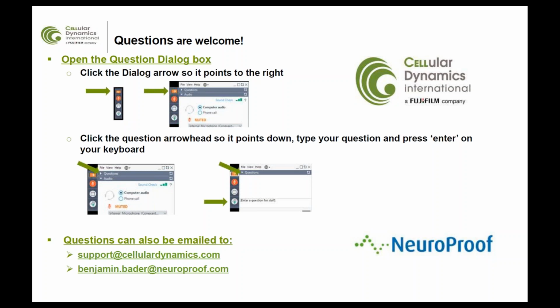Okay, all right, thank you, Blake. Another question just regarding the culture and the timing of the activity development within the GlutaNeurons. The question is, how long should the cells be in culture before they start to fire action potentials, and how long before they are synchronized?